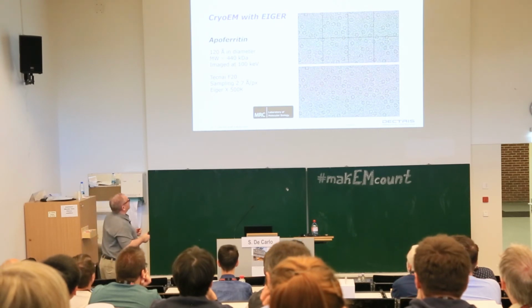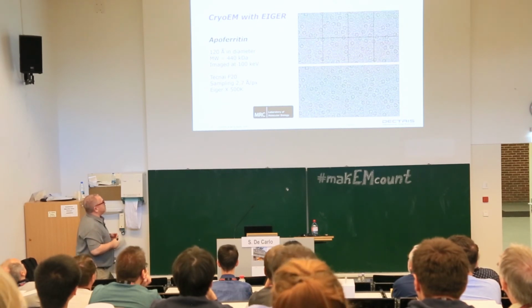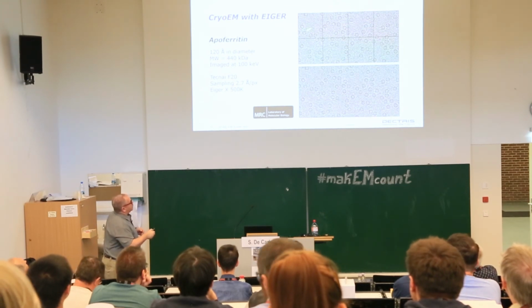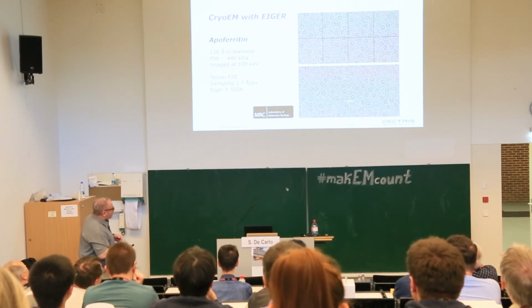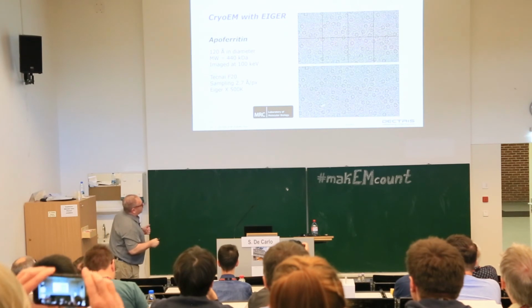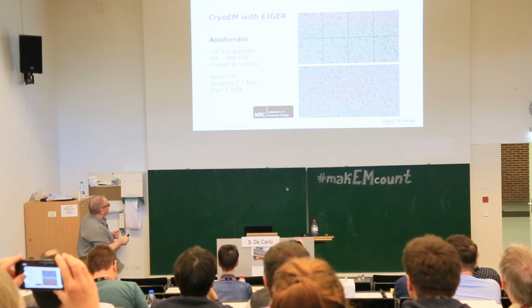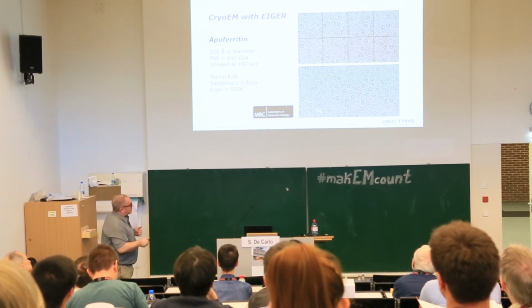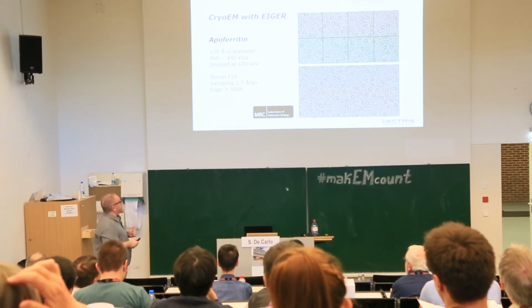So the new standard in cryo-EM, well, when I learned it, was tobacco mosaic virus, but things have changed a bit now. Apoferritin is the new standard sample. You can see a raw picture from our 500K. So you have 8 chips aligned in this rectangular shape, and we can do gain correction in such a way that you have here your field of view with 20 to 50 apoferritin molecules. But because of the pixel size, in order to provide high resolution sampling, you have to work at a fairly high magnification, which then reduces your field of view, and then you have to eventually collect a lot more data. But this was just a proof of concept.